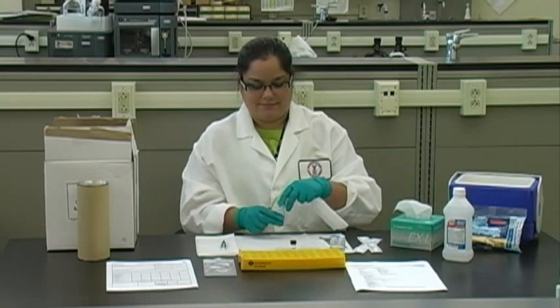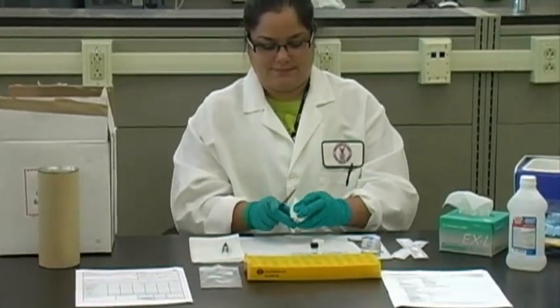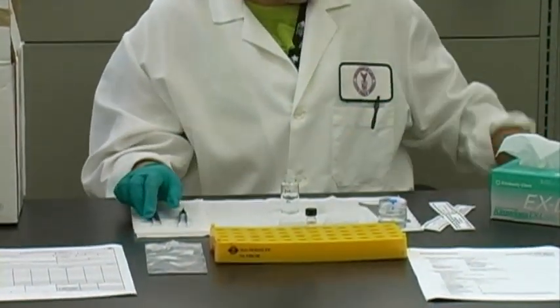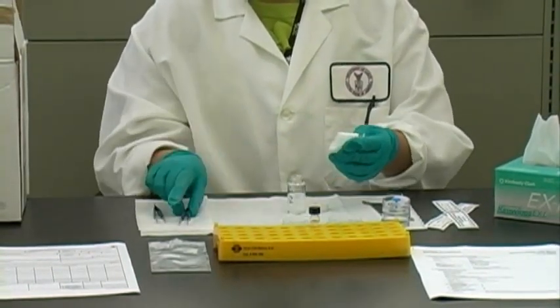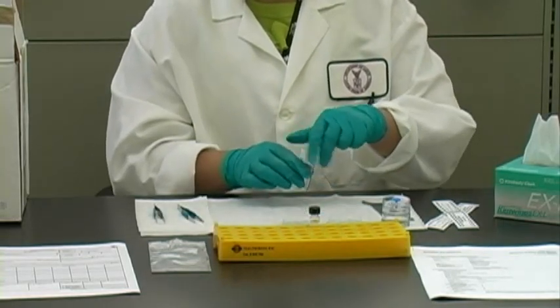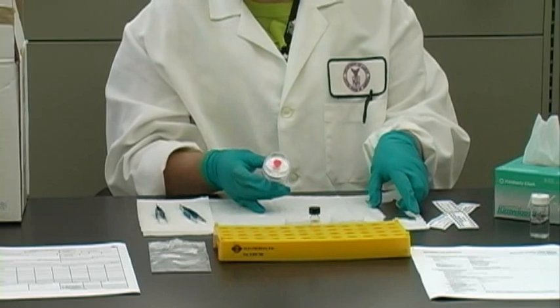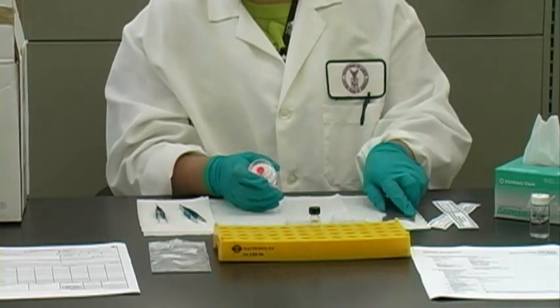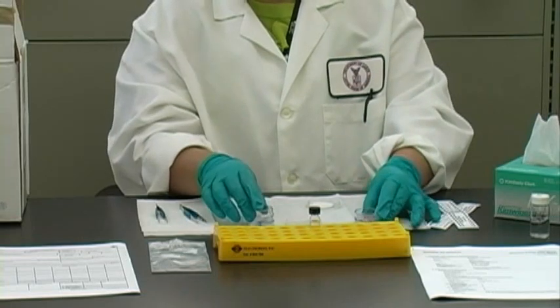Put on a new pair of nitrile gloves every time this procedure is performed. Clean the metal forceps each time you use them with isopropyl alcohol. Remove the coated filter from the cassette using the metal forceps.